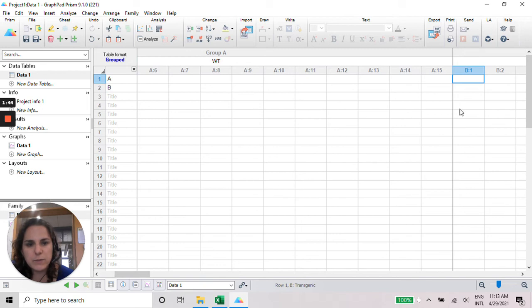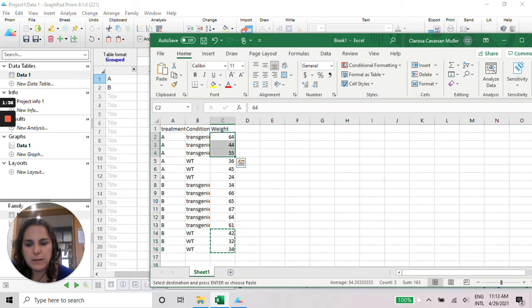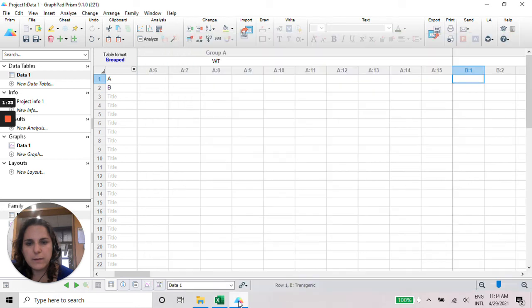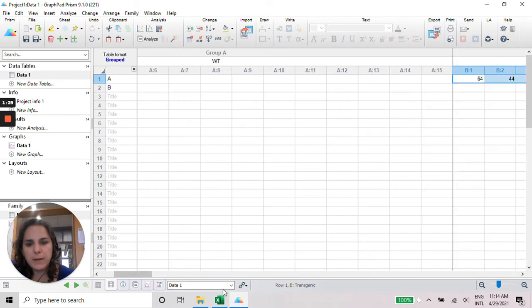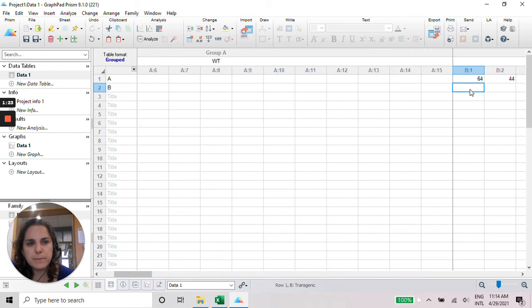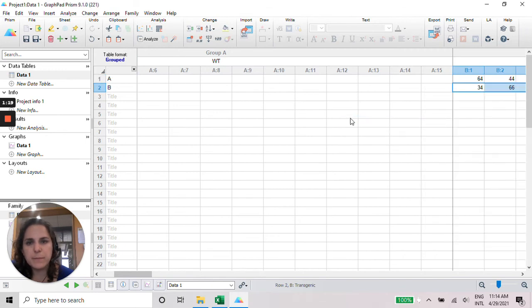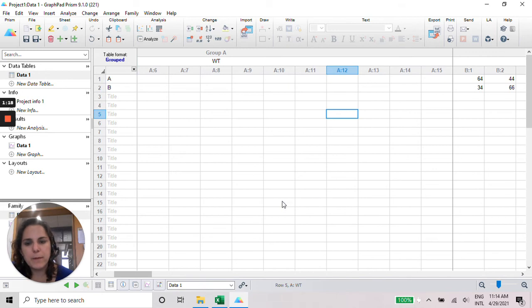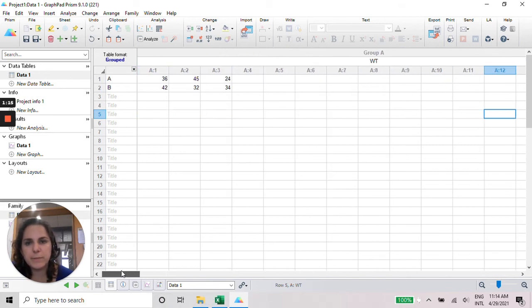Let it be here. So in this case is transgenic A. We just go here and transgenic A. And the same thing for the last one, transgenic B. Okay, so all the data is copied and pasted here.